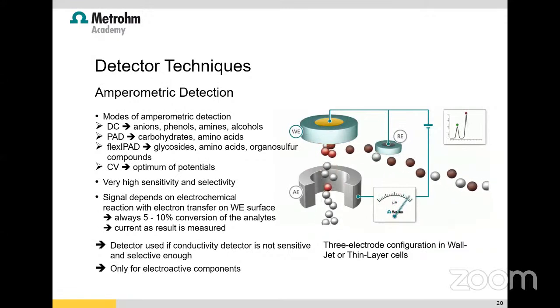Then we can distinguish how much glucose is there, how much sucrose is there, how much lactose is there, how much maltose is there. So you can differentiate between different monosaccharides, different disaccharides, and different oligosaccharides also. As you know, we have this FOS, fructan oligosaccharides. Those also can be done using this detector. Now let me tell you how it works.